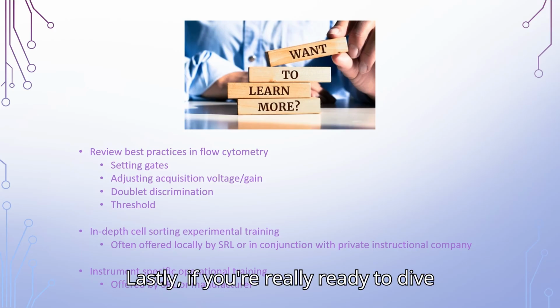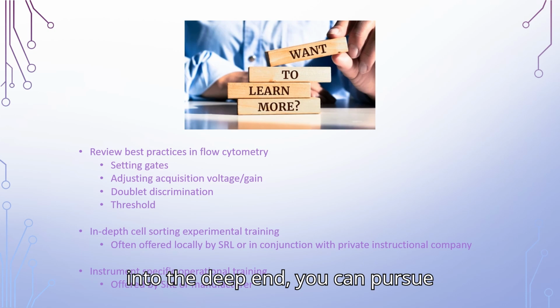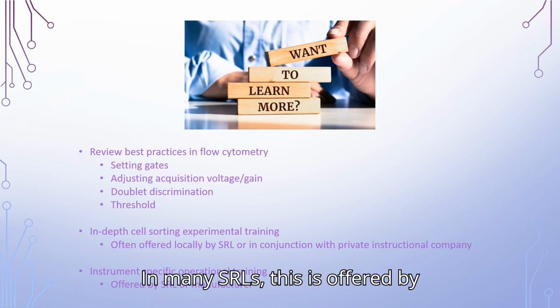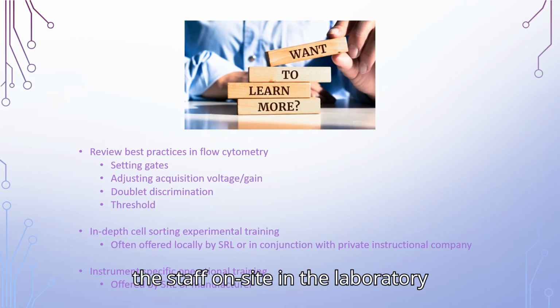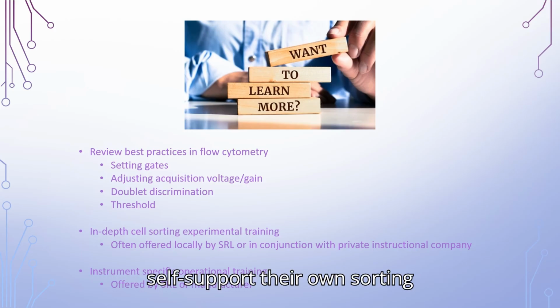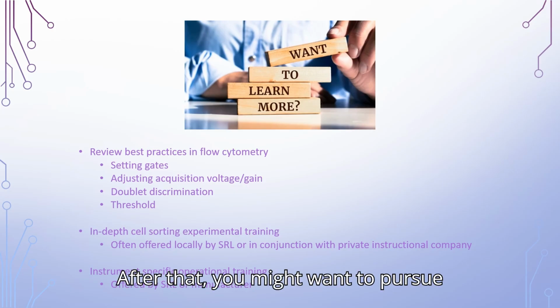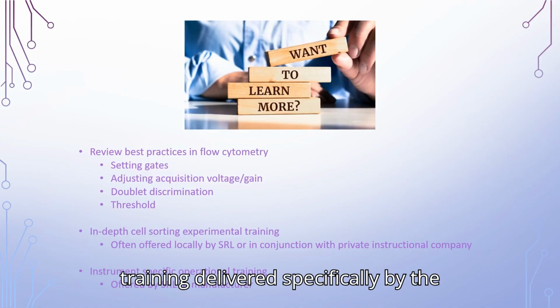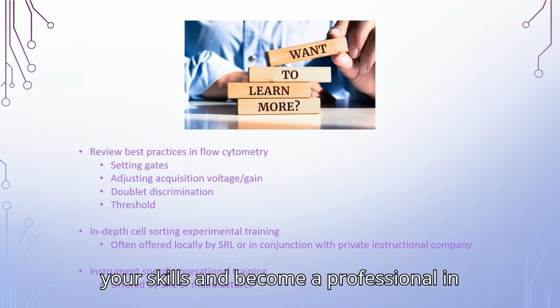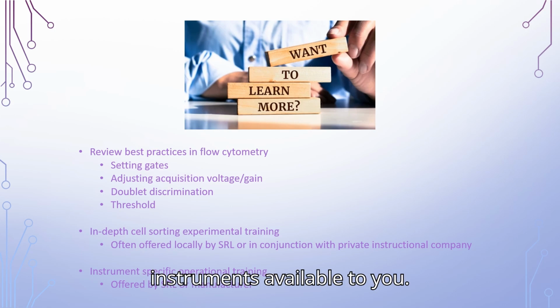Lastly, if you're really ready to dive into the deep end, you can pursue instrument-specific operational training. In many SRLs, this is offered by the staff on-site in the laboratory to allow users to become operators and self-support their own sorting experiments. After that, you might want to pursue training delivered specifically by the manufacturer for the instrument that you're using so that you can really hone your skills and become a professional in the art of sorting on the specific instruments available to you.